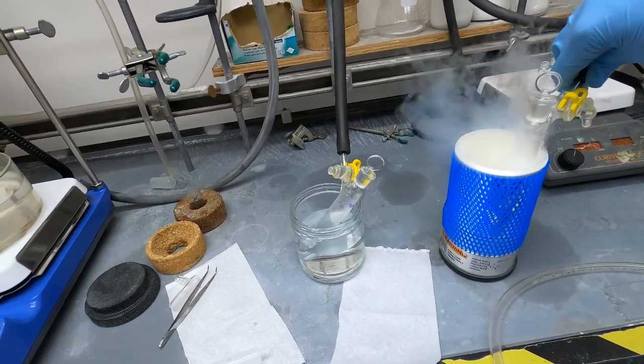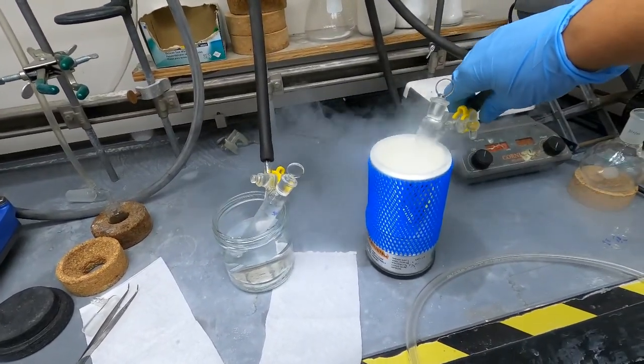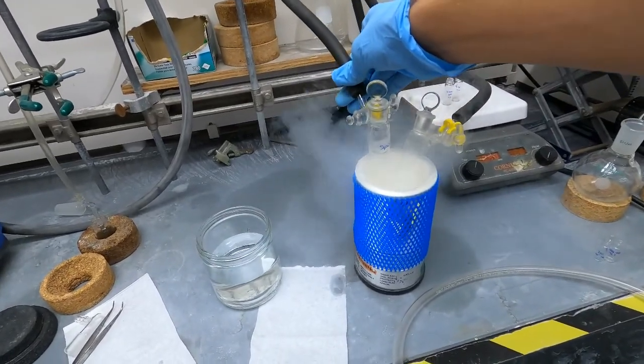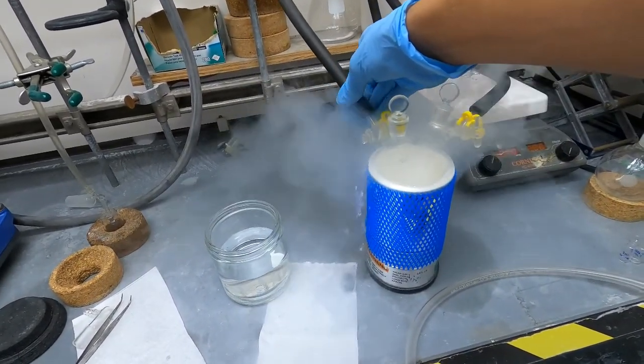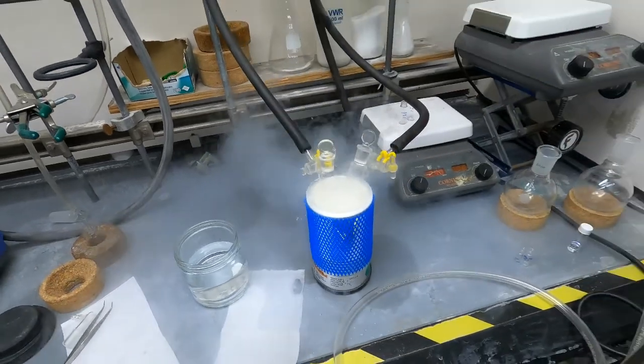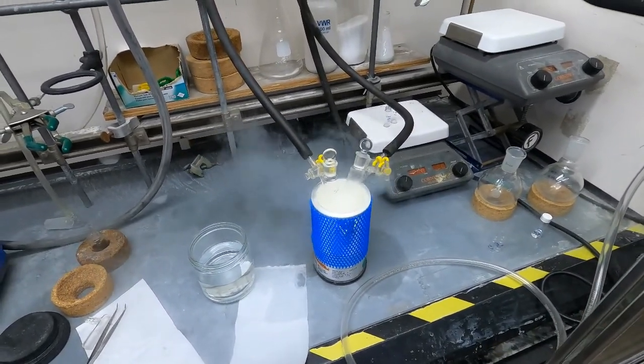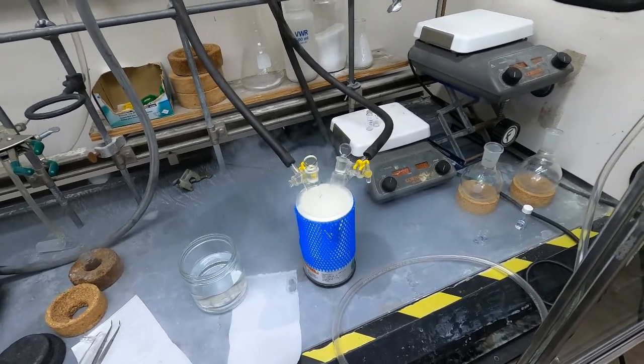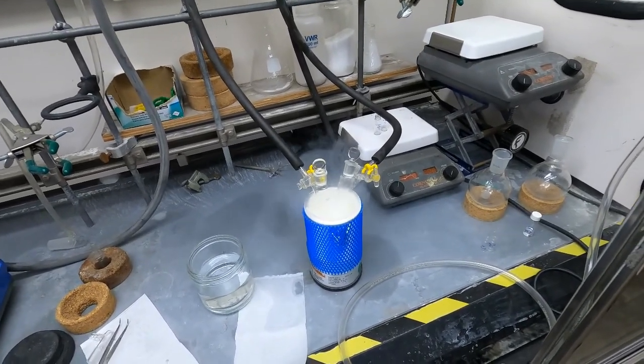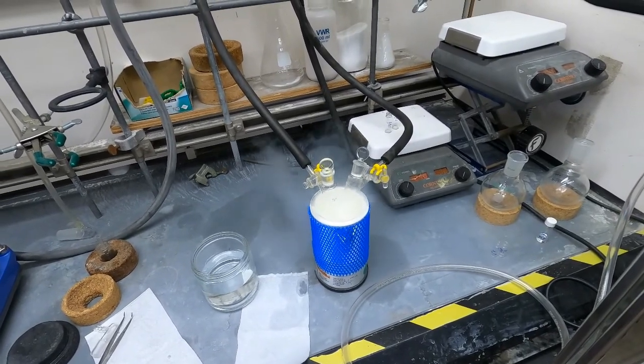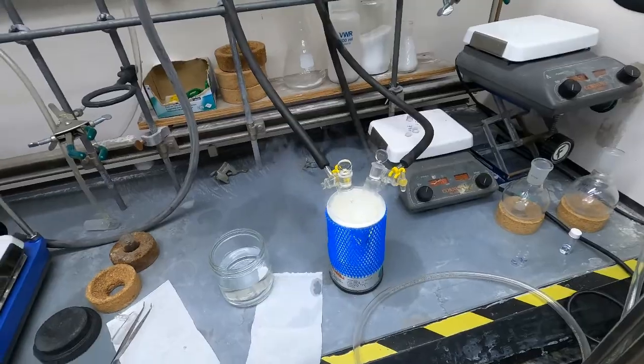We're going to put both of these Schlenk tubes back into our liquid nitrogen dewar so that we can freeze again. I'll fast forward through some of these parts but we're doing the exact same thing that I showed initially. We're going to freeze and then once the reaction mixture is frozen, we'll pump on the mixtures for five minutes and then thaw and do that cycle one more time.